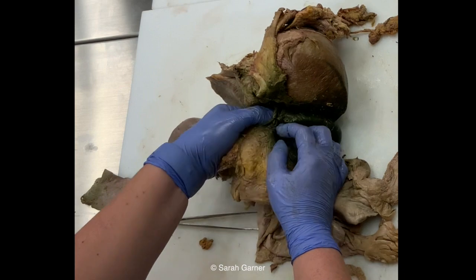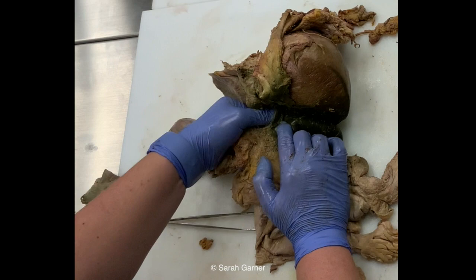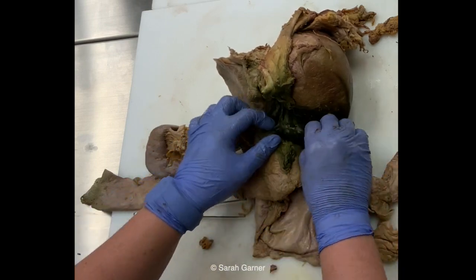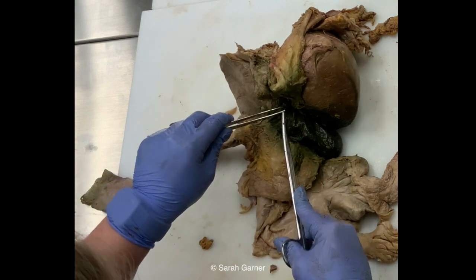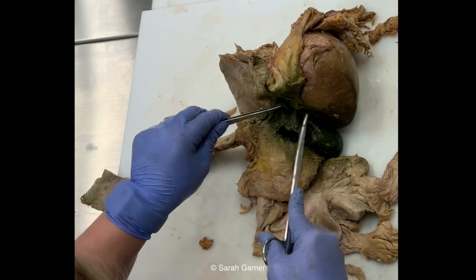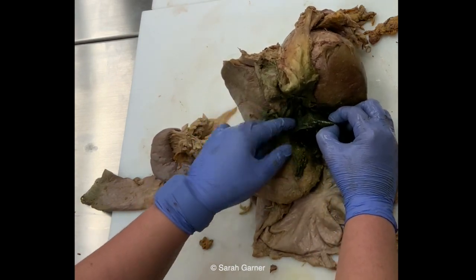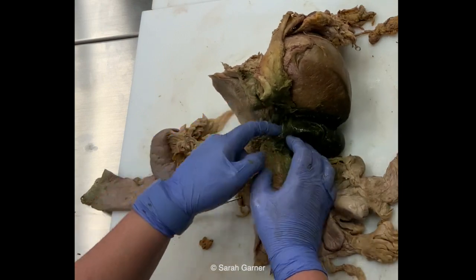Everything is a little bit green and discolored, which again, in a fixed cadaver, is not abnormal. So it's hard to tell just based on color what's what. So again, you gotta feel. This is coming from the gallbladder, so this has to be bile duct, right? So this is gonna be cystic duct. I can feel it right in there. And once it joins with your common hepatic duct here, this is now your common bile duct, okay?